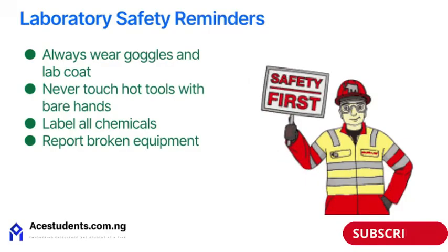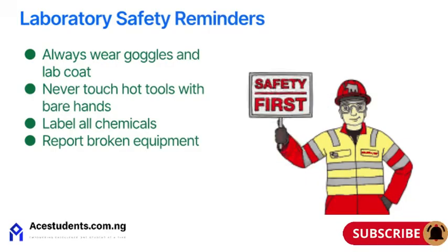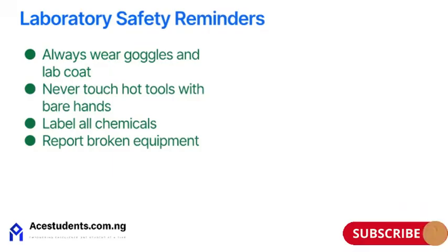Now, let's take a look at some laboratory safety measures. Always follow lab safety rules. Wear goggles and a lab coat. Use tongs for hot tools. Label everything clearly. Report broken tools immediately.